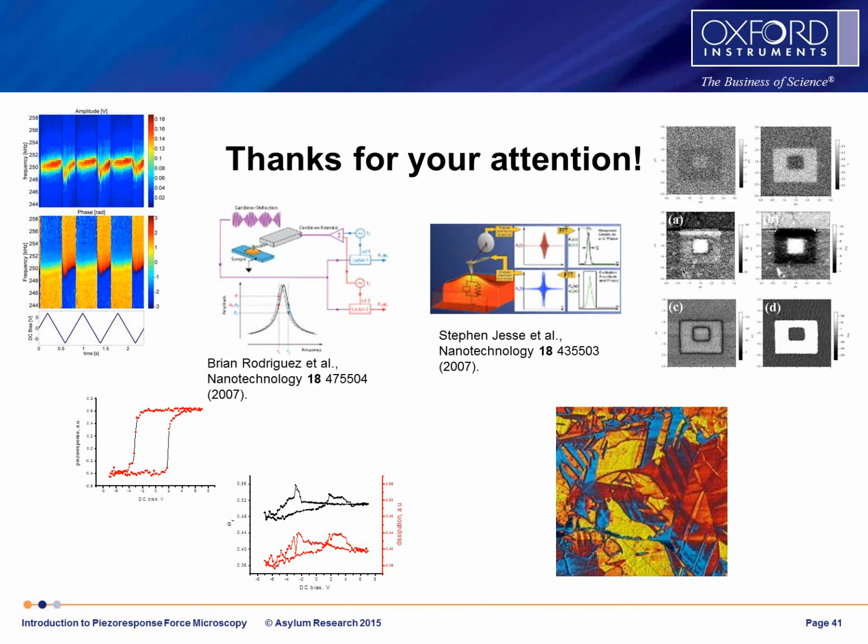Okay, thanks. Another question for you, Sergey. How do electrical scanning modes work under aqueous conditions? So it depends on the frequency. If we operate our driving frequencies around hundreds of kilohertz or higher, they actually operate exactly the same way as in an ambient environment.